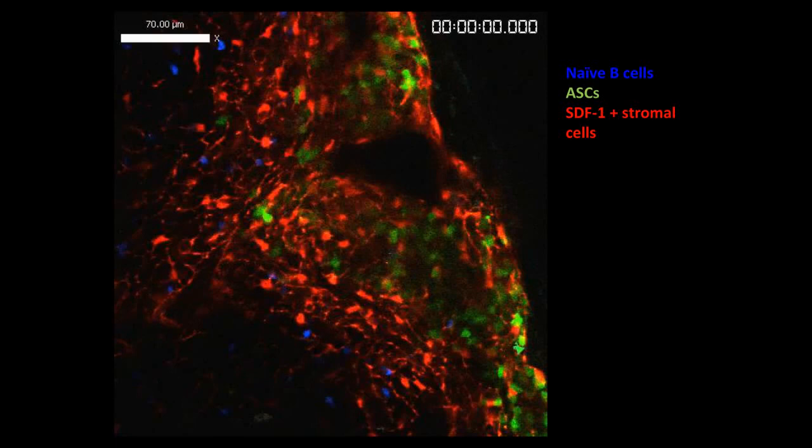Underlying the myeloid cells in the medullary cords is a network of stromal cells. The chemokine receptor CXCR4 is highly expressed on ASCs and is critical for the retention in the bone marrow and positioning in the medullary cords. Using an SDF1 or CXCL12 reporter, the chemokine for CXCR4, shown in red, we can see that the medullary cords are highly enriched for the SDF1 producing cells. ASCs are directly in contact with these cells and migrate along them.